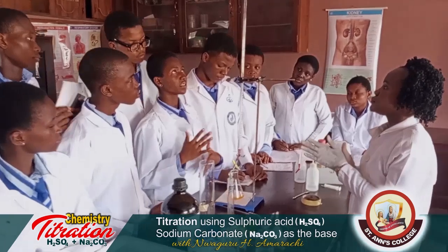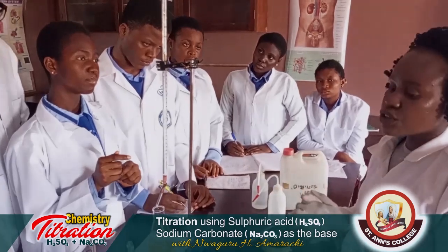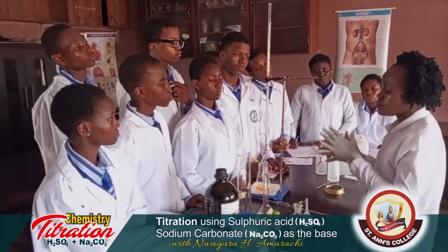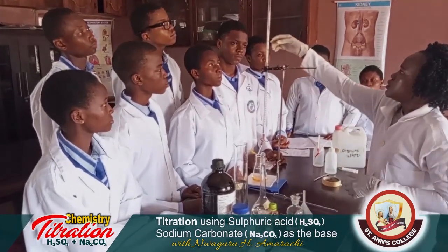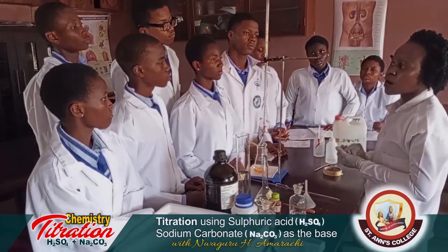Excuse me, teacher. Why are we rinsing the burettes with the substance which needs to be added into them? It is already diluted. The acid is diluted to our required concentration, and the base is also diluted to our required concentration. Now, remember we rinse the apparatus with distilled water, and every drop counts.